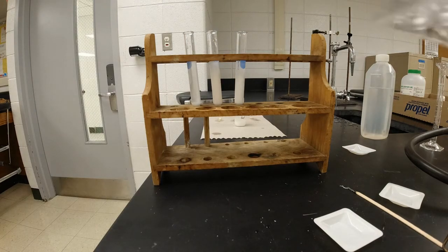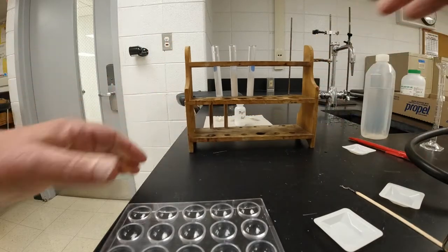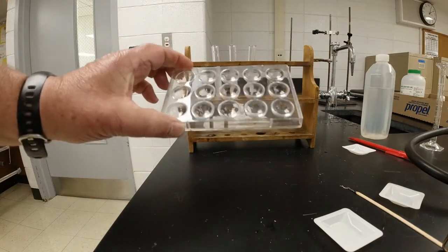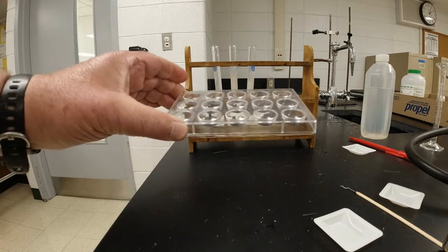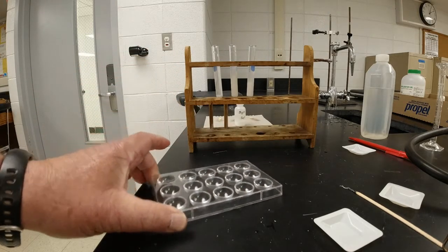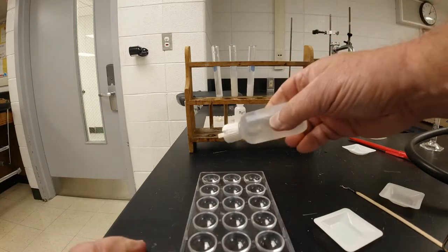And while I'm doing that, I'm going to do this part with a spot plate here. All right, this plastic dish is called a spot plate. And the reason why it's called a spot plate, it's actually got 3 by 5. It's got 15 little dishes in it itself. So what I'm going to do with this, it tells me that I'm going to add 10 drops of each of these solutions to it. So I need 10 drops of magnesium chloride, and I'm going to put that in this one.